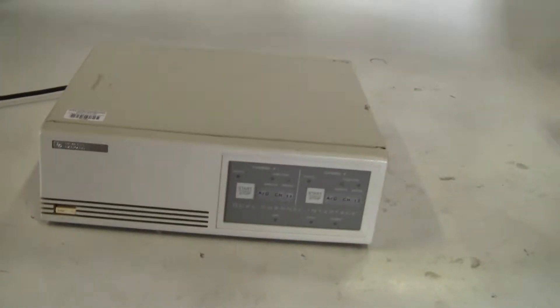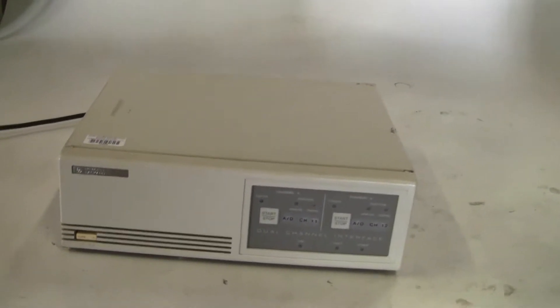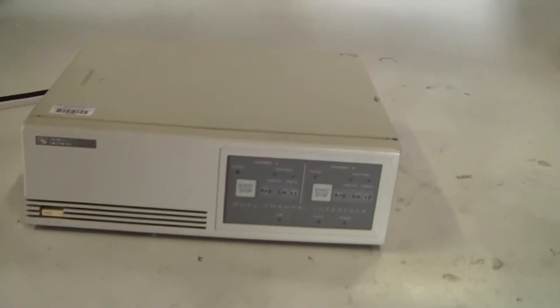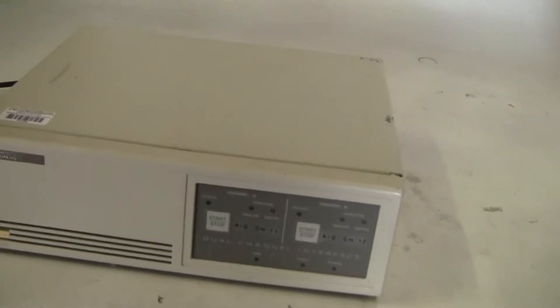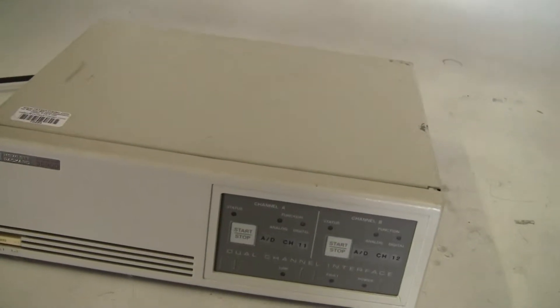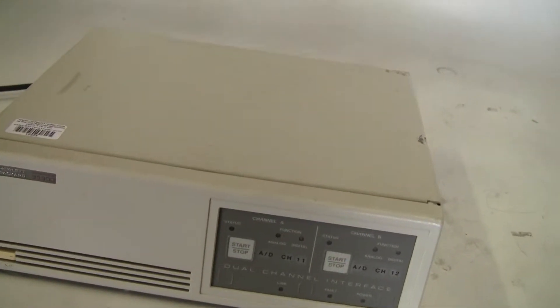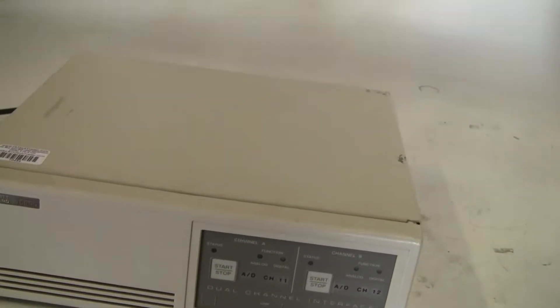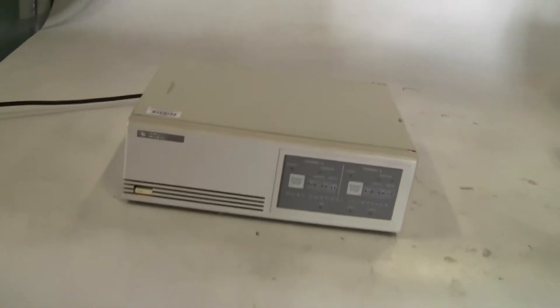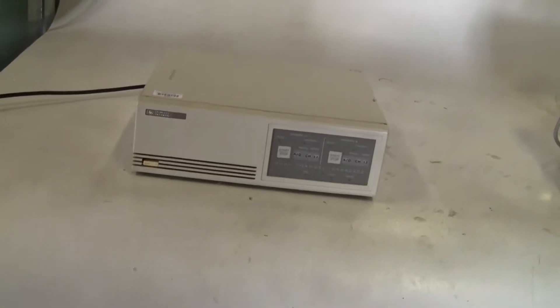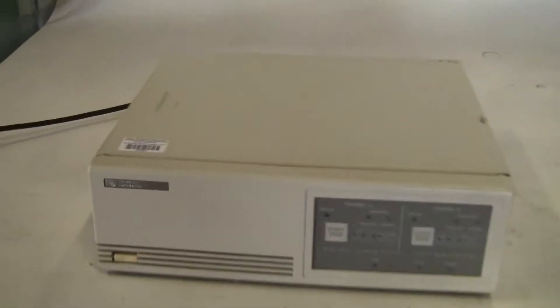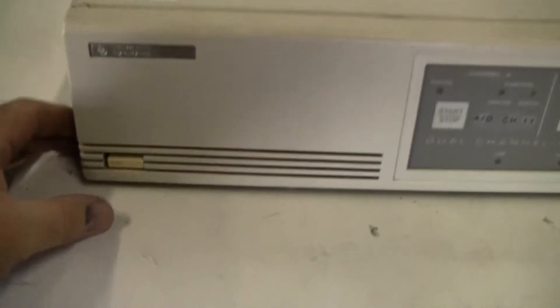Hi, this is Jim from High Tech Trader. Today we're looking at the Hewlett Packard Dual Channel Interface Model 35900B. I don't know much about it, but I'll show it to you powered up.